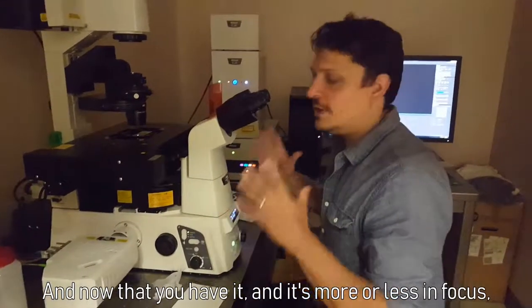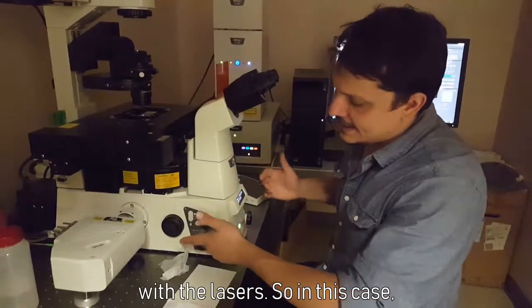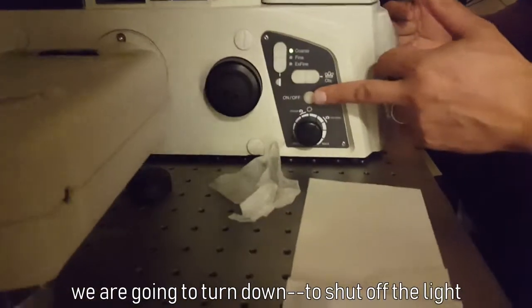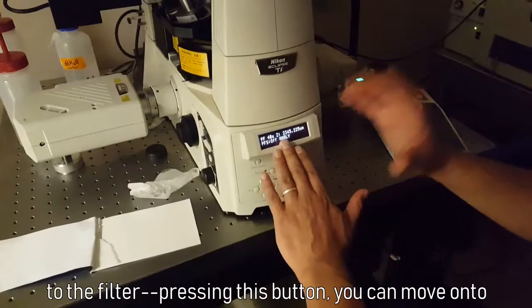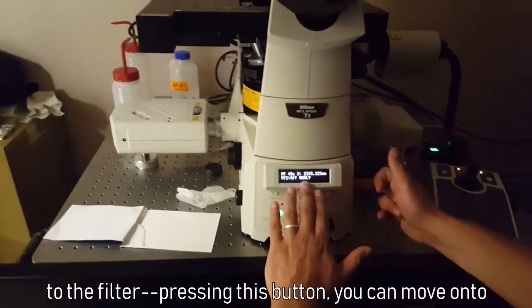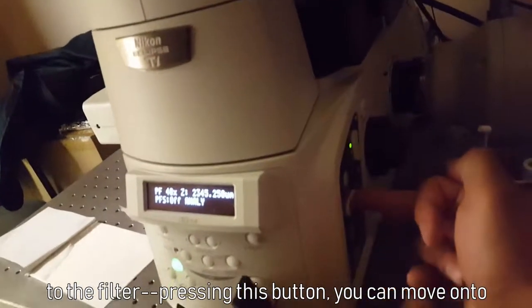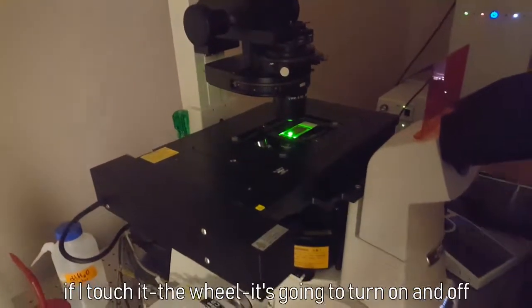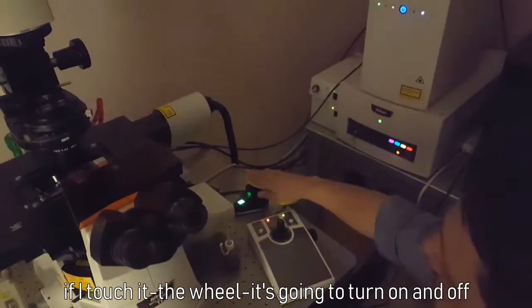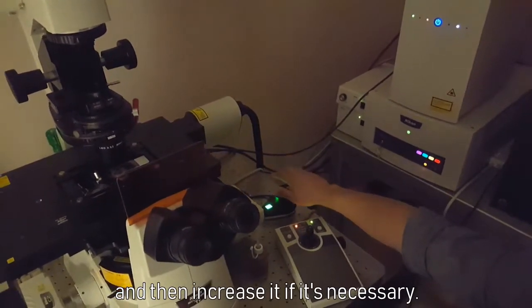And now that you have it and it's more or less in focus, most of the time you want to see what's happened with the lasers. So in this case, we are going to turn down to shut off the light for the DIC, and we have to move from the analyze to the filter. Pressing this button, you can move onto the first laser power. In this case it's on. If I touch the wheel, it's going to turn on and off. It's going to start with very low laser power and then increase it if it's necessary.